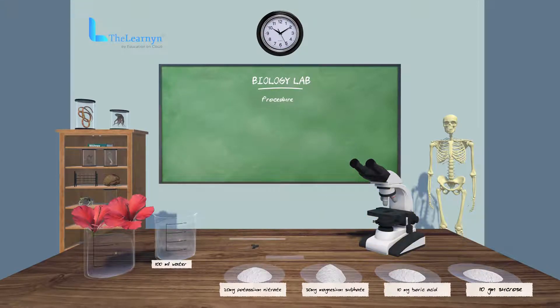Prepare the pollen germination medium by dissolving 10 grams sucrose, 10 milligrams boric acid.